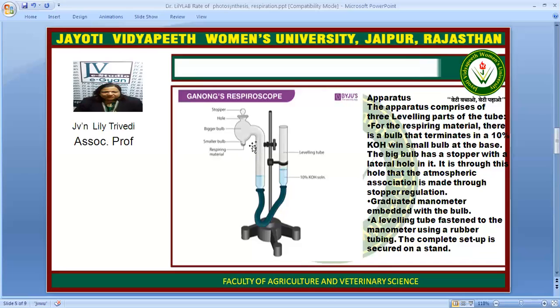A graduated manometer is connected to the bulb, and the leveling tube is fastened to the manometer using rubber tubing. The complete setup is mounted on a clamp stand. There is a 10% KOH solution, a leveling tube, and the respiring materials are placed in the setup.